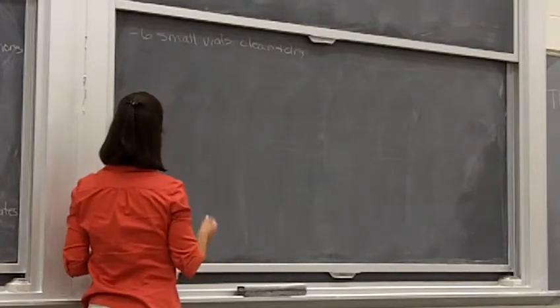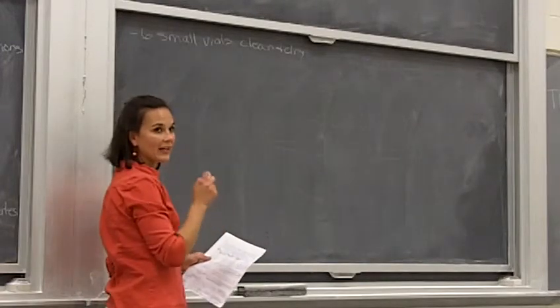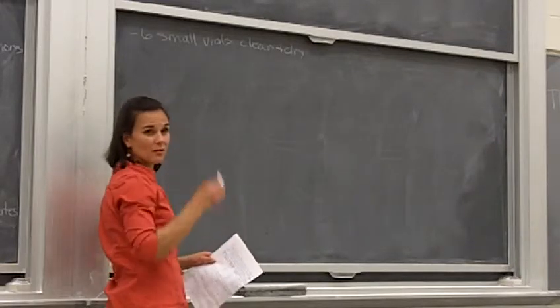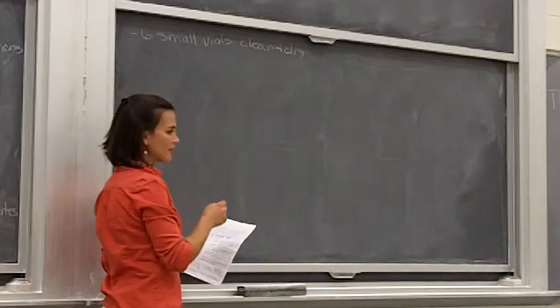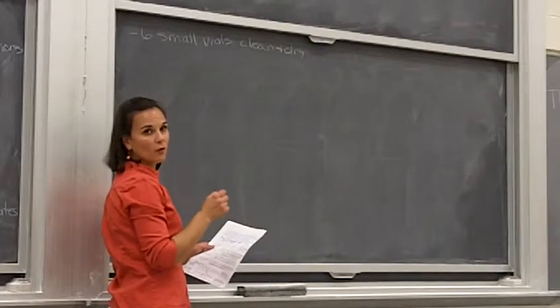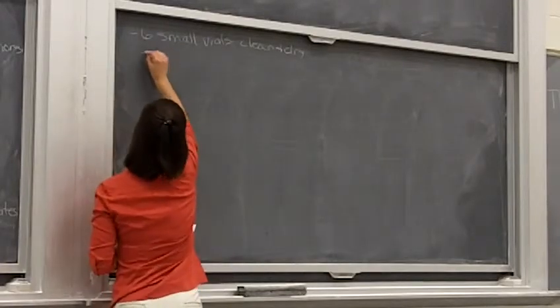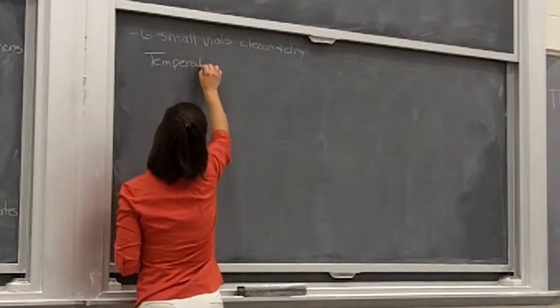The other thing that you want is this table that I am going to draw here on the board. You want that in your notebook, probably on a full notebook page so that you have plenty of space to fill in the table. You want this table put together before you start heating and collecting any fractions, okay? So you're going to have, in this table, a column for temperature.